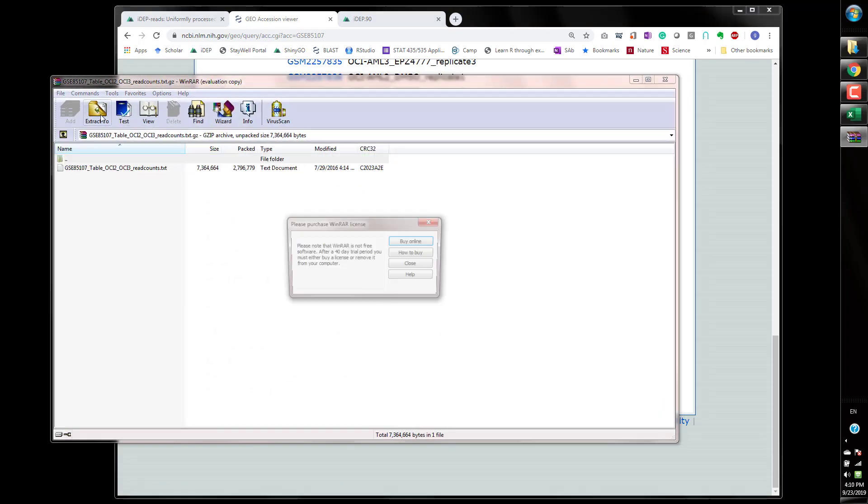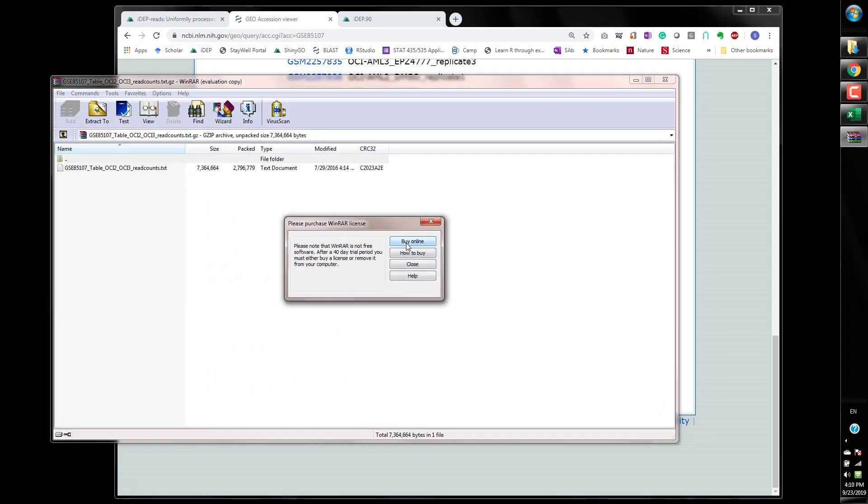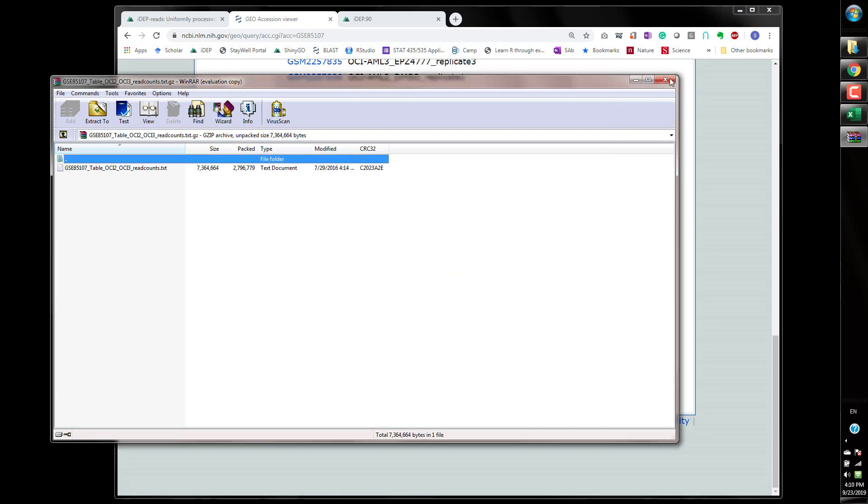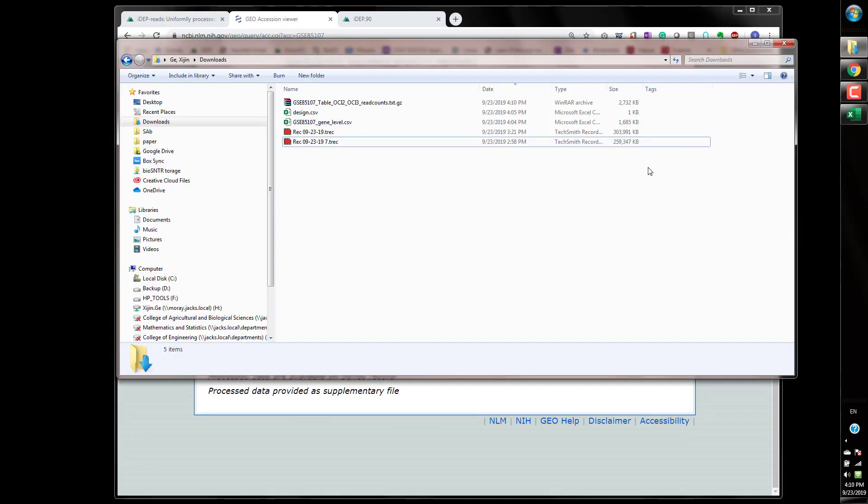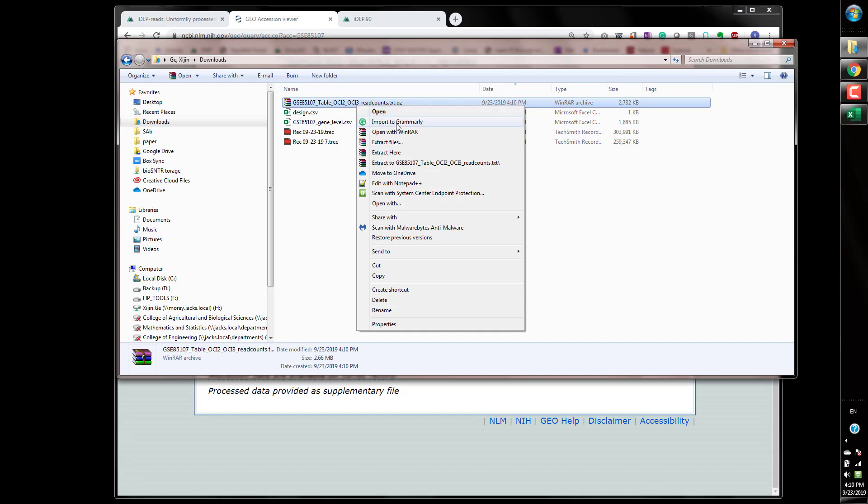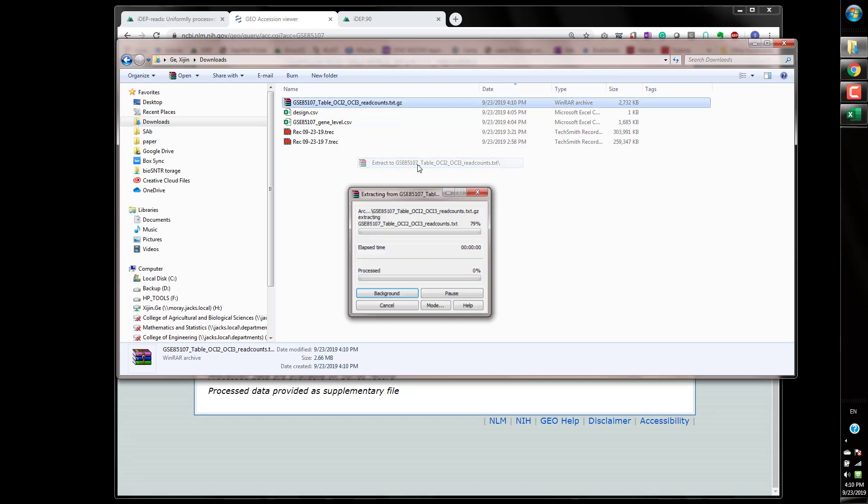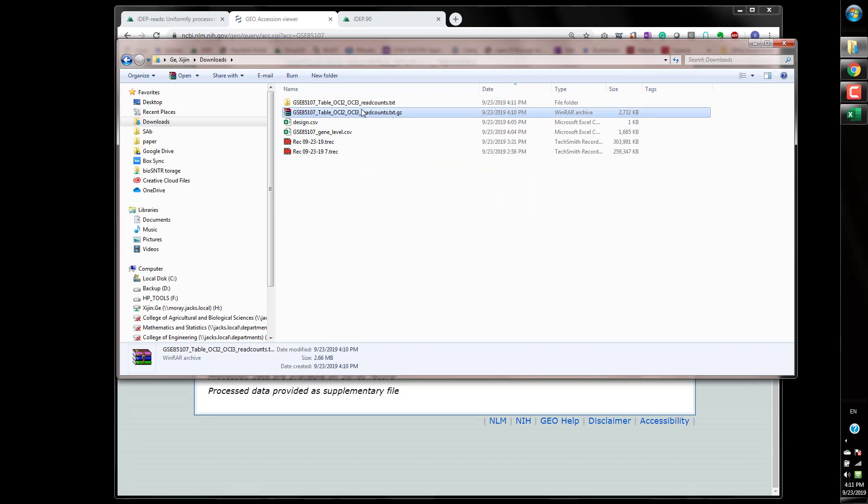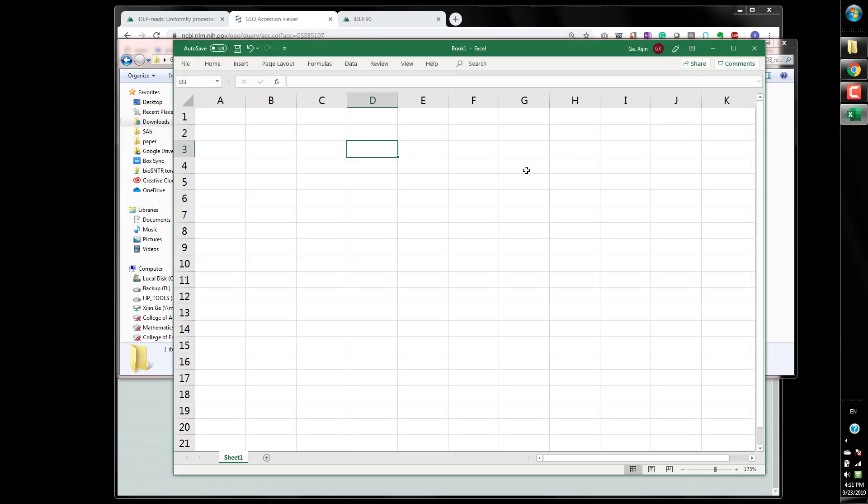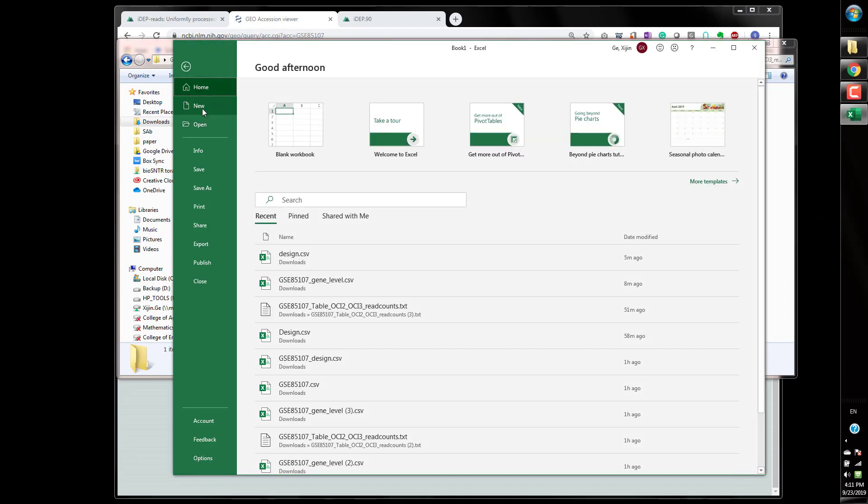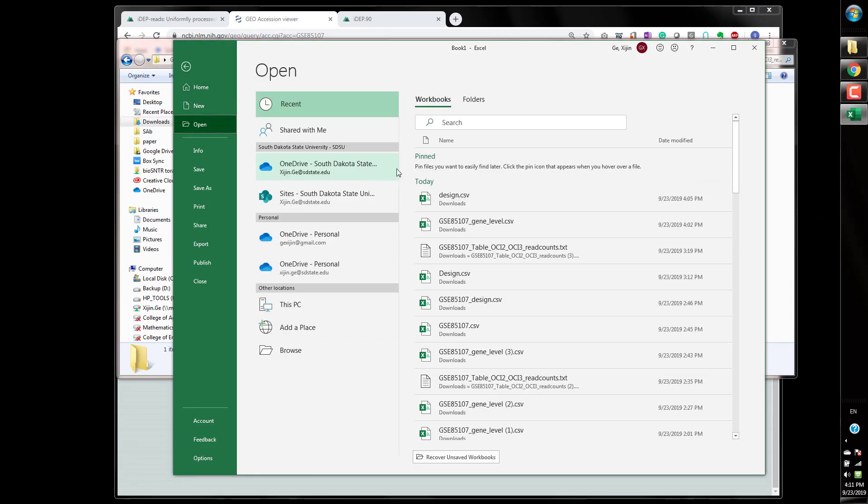I mentioned that the gene expression omnibus also has read counts data so obviously you can download these files and extract and the files will be here and obviously you can open that up in Excel.